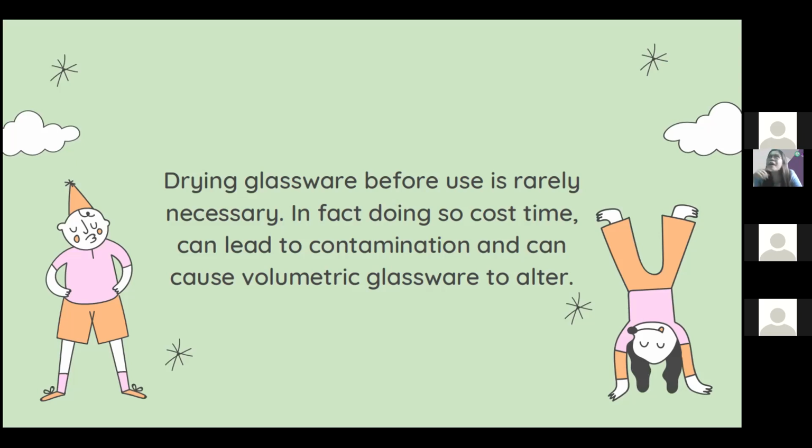However, merong mga parts ng tissues na maiiwan inside. So that will be now a cause of contamination. So if we are going to use the glassware sa sunod, meron na siyang mga tissues na naiwan doon, particles, magkakaroon na ng contamination. So tama na cleaning or drying the inside of the glasswares are not really necessary. Okay, next.